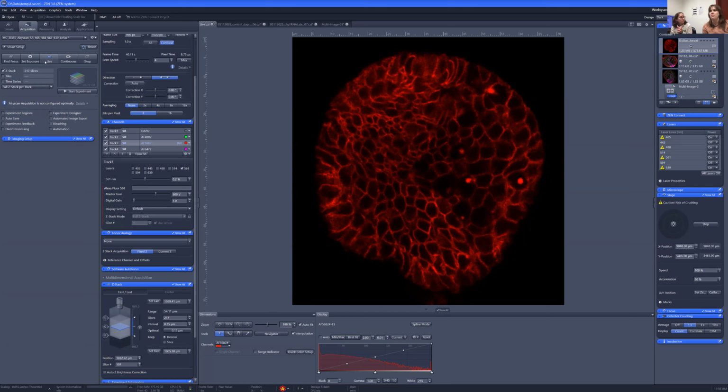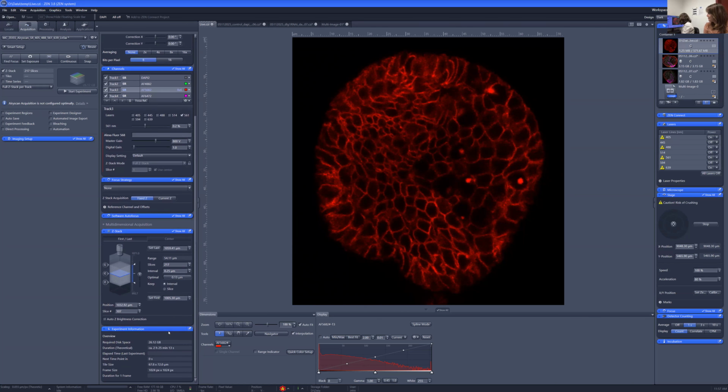I do know just from being your friend that you have worked very closely with a microscopy specialist to build an algorithm to help you quantify these images, right? Yeah. So this is something I can tell you a little more about when we're watching one of the channels come in. But for now, I'm going to start my acquisition. While it's running, we can chat a lot more because it's going to run for a pretty long time. I'll let you start it actually.